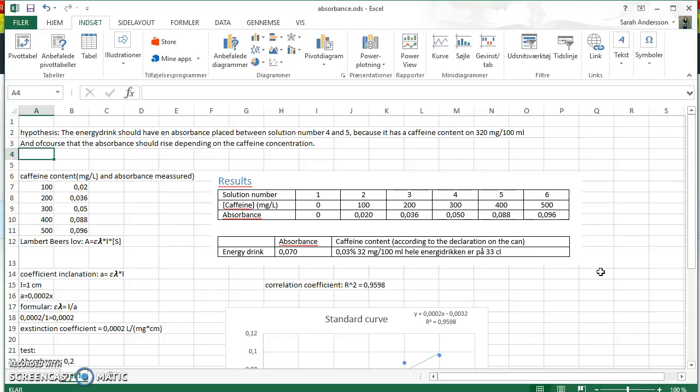In this experiment, we will be needing spectrophotometry, which is a method to measure how much of a chemical substance is absorbing an amount of light that has been sent through it, based on a wavelength of light and the light distance it travels in this microcuvette. So it measures how much light has been lost from the amount of light that has been sent out.